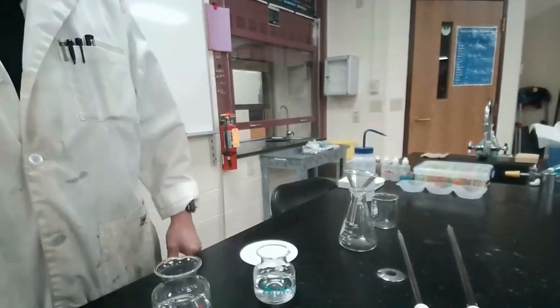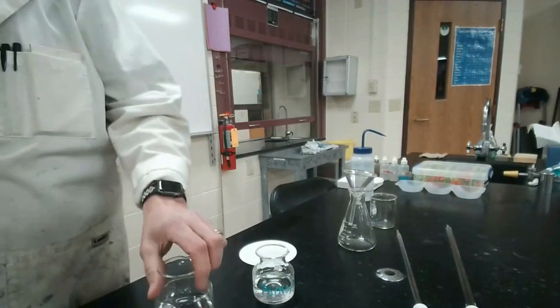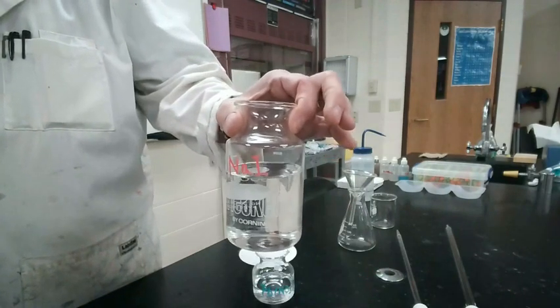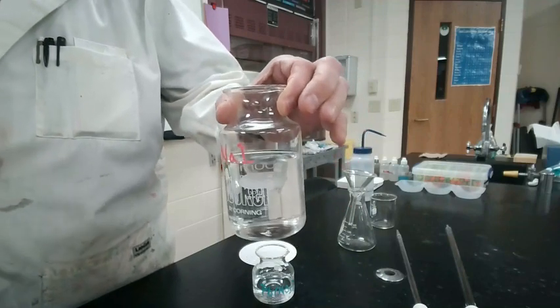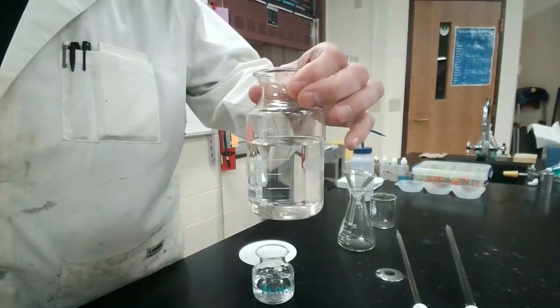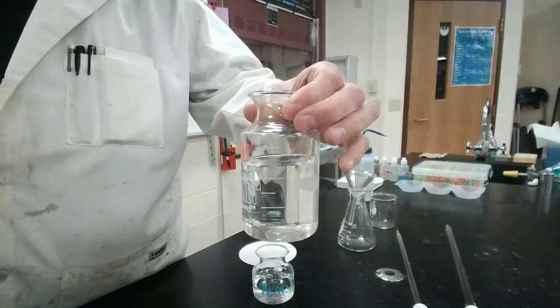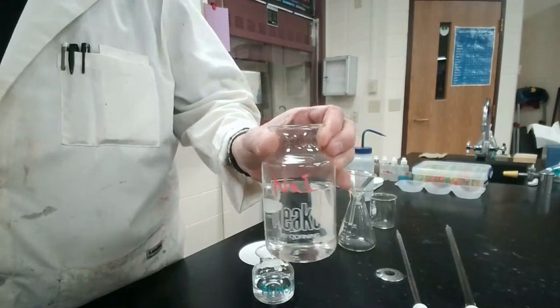All right, if you missed the lab, I'm going to go through it with you as an alternate assignment. First thing you're going to need to do, take observations of sodium iodide, ladies and gentlemen. Here is the sodium iodide, okay? Now, no odor. Take a look at it. You should be able to get at least 3 more observations besides the one that I just gave you. And this is the sodium iodide.